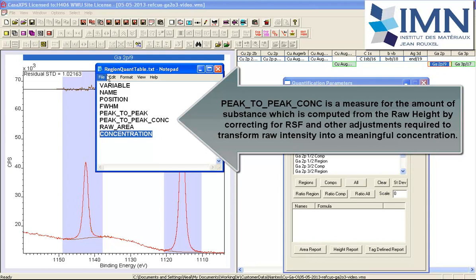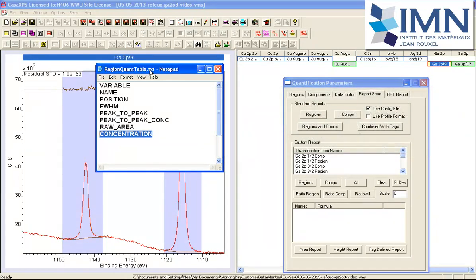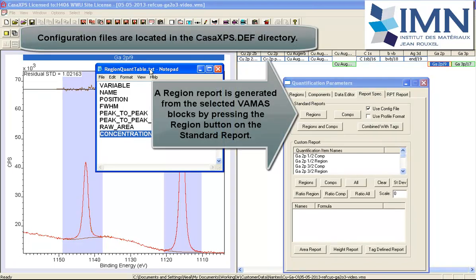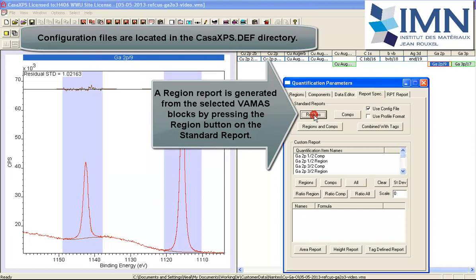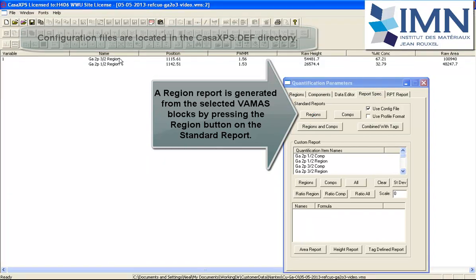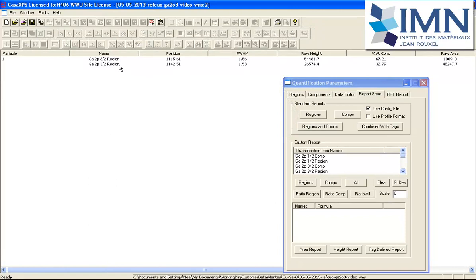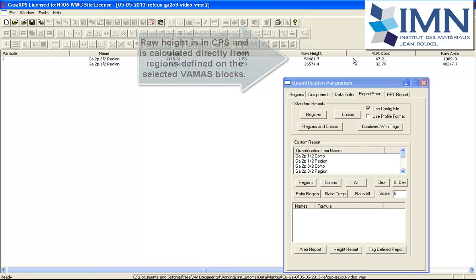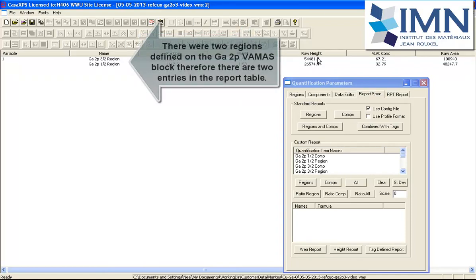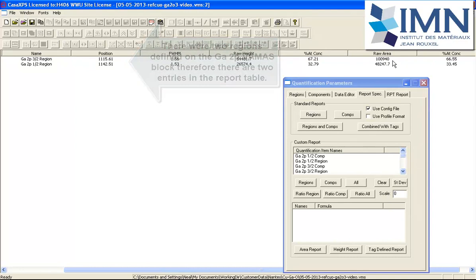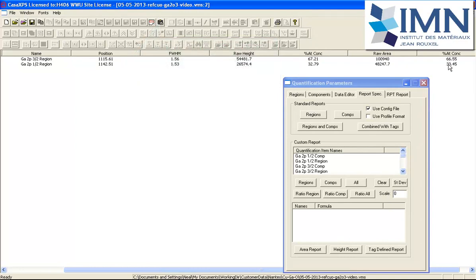So there's the region quant table.txt file. It's in the CASAXPS.DEF directory. When I press the region button, a text report is generated. You can see the name has come from the regions. I've got the position, the full width half maximum, the raw height, the percent concentration based on the raw height—I know that because of how the configuration file was created—and I've also got the raw area and the atomic concentration calculated based on the raw area.